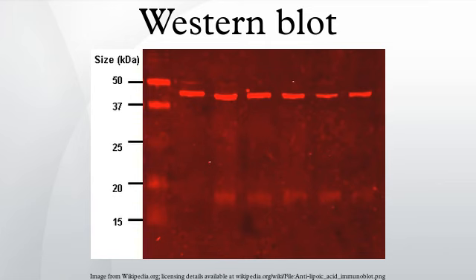The uniformity and overall effectiveness of transfer of protein from the gel to the membrane can be checked by staining the membrane with Coomassie Brilliant Blue or Ponceau S dyes. Ponceau S is the more common of the two, due to its higher sensitivity and water solubility, the latter making it easier to subsequently destain and probe the membrane, as described below.